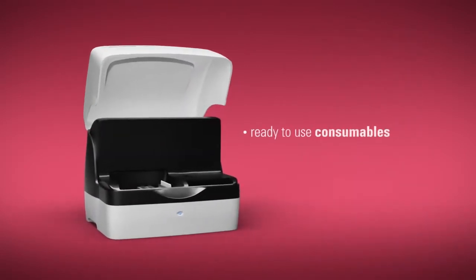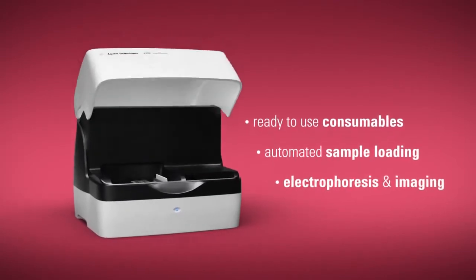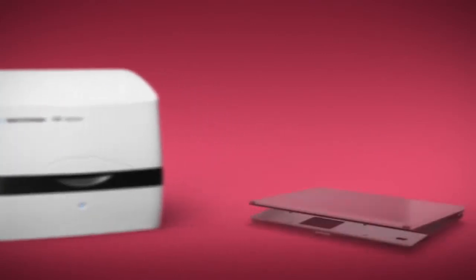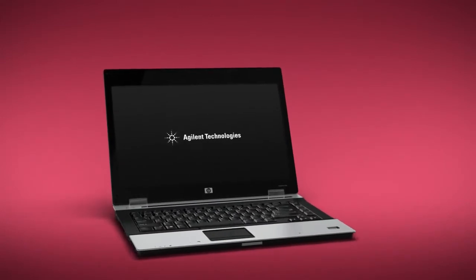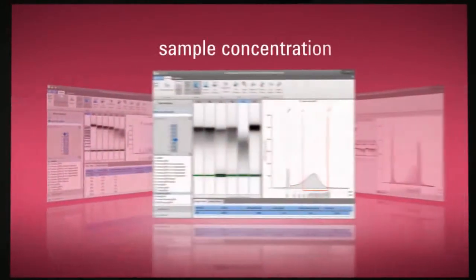Ready-to-use consumables combined with automated sample loading, electrophoresis, and imaging deliver reproducible results in less than two minutes per sample. Digital results make analysis easy and exact, while Agilent user-friendly software provides a range of useful functionality, including gel images, sample comparisons, molecular weight sizing, and sample concentration.